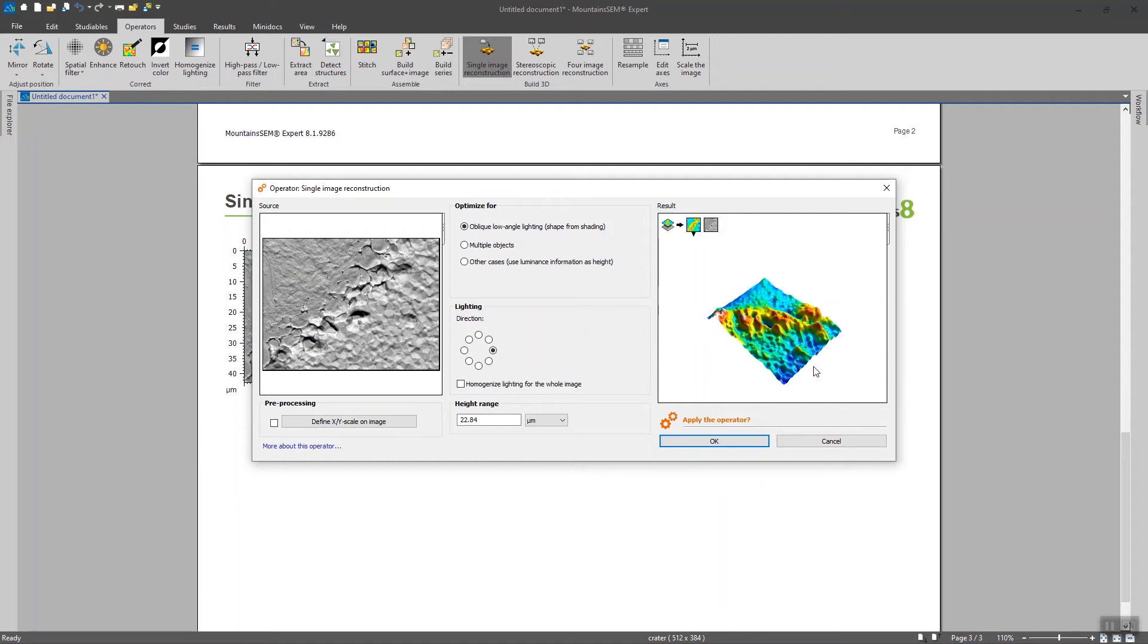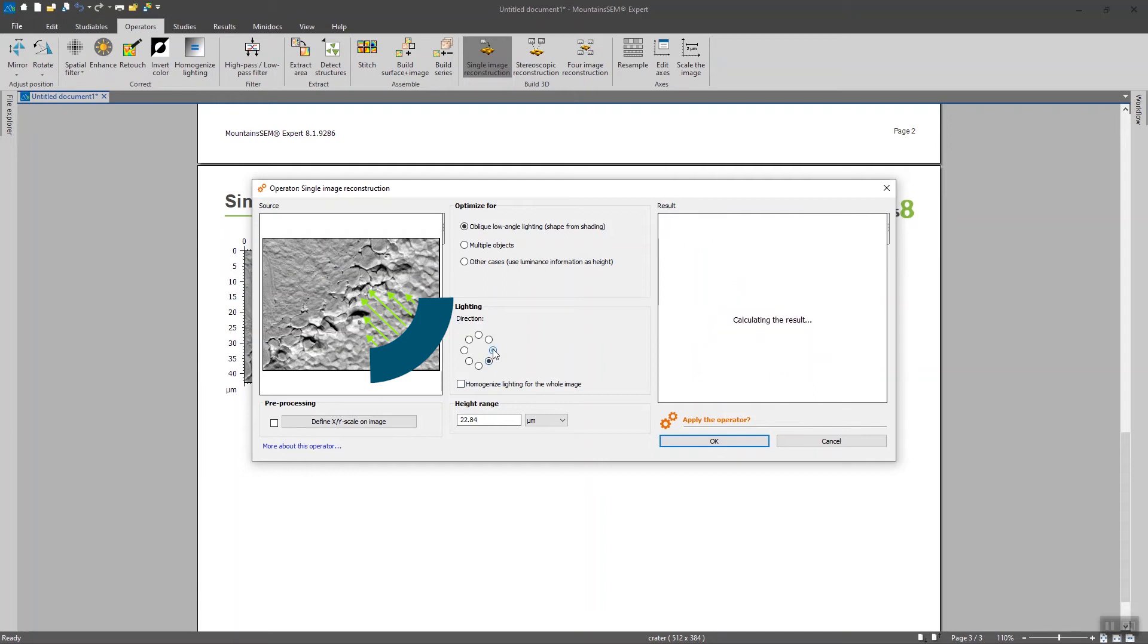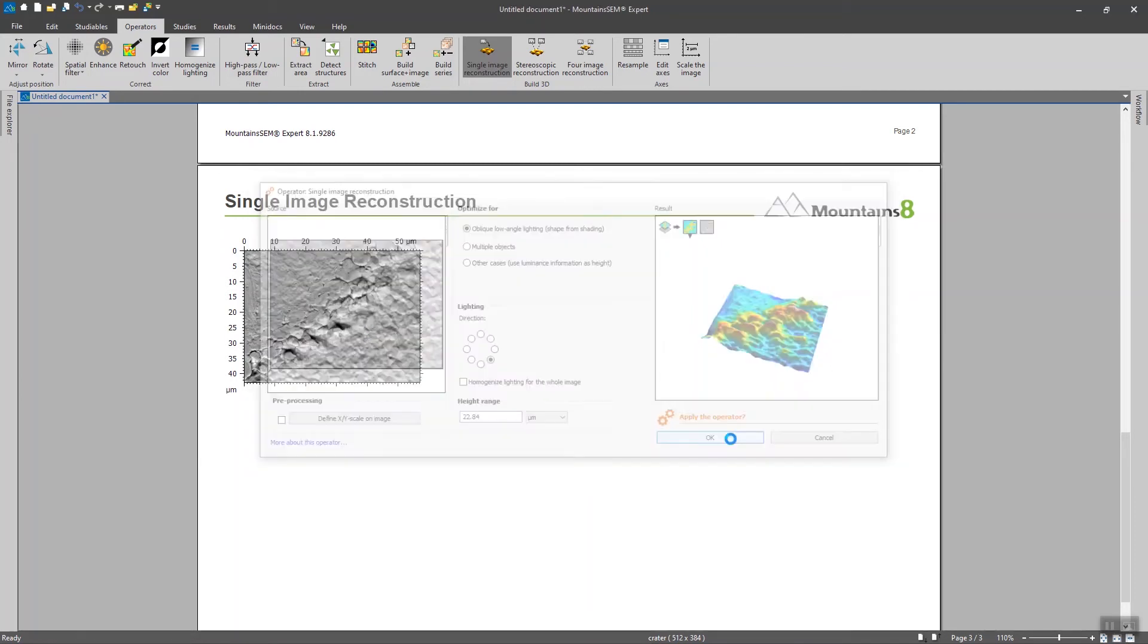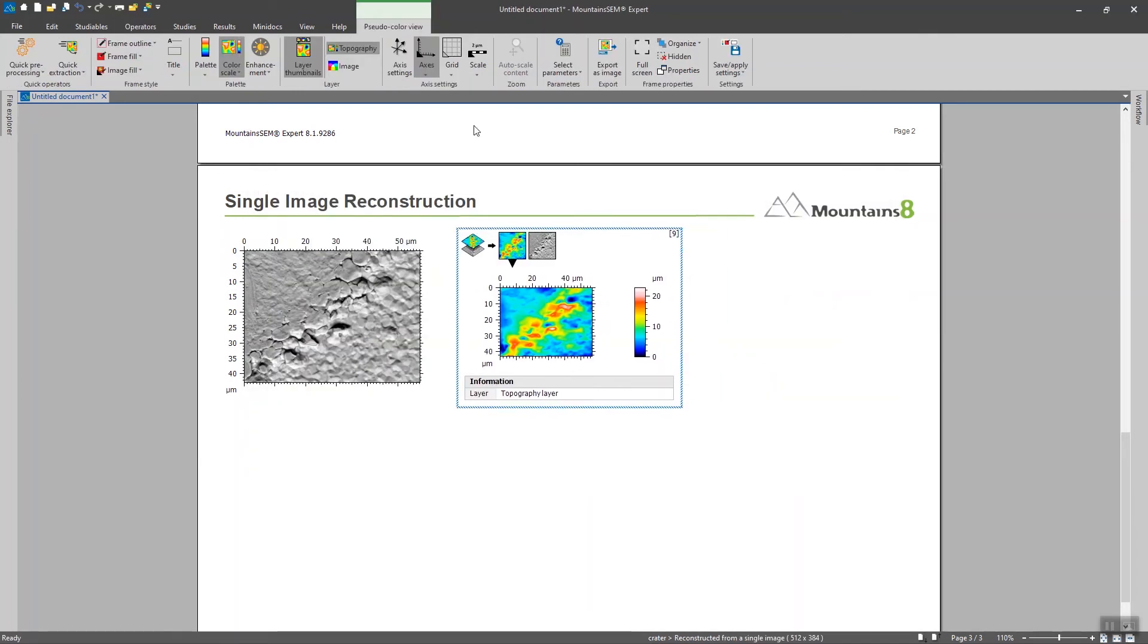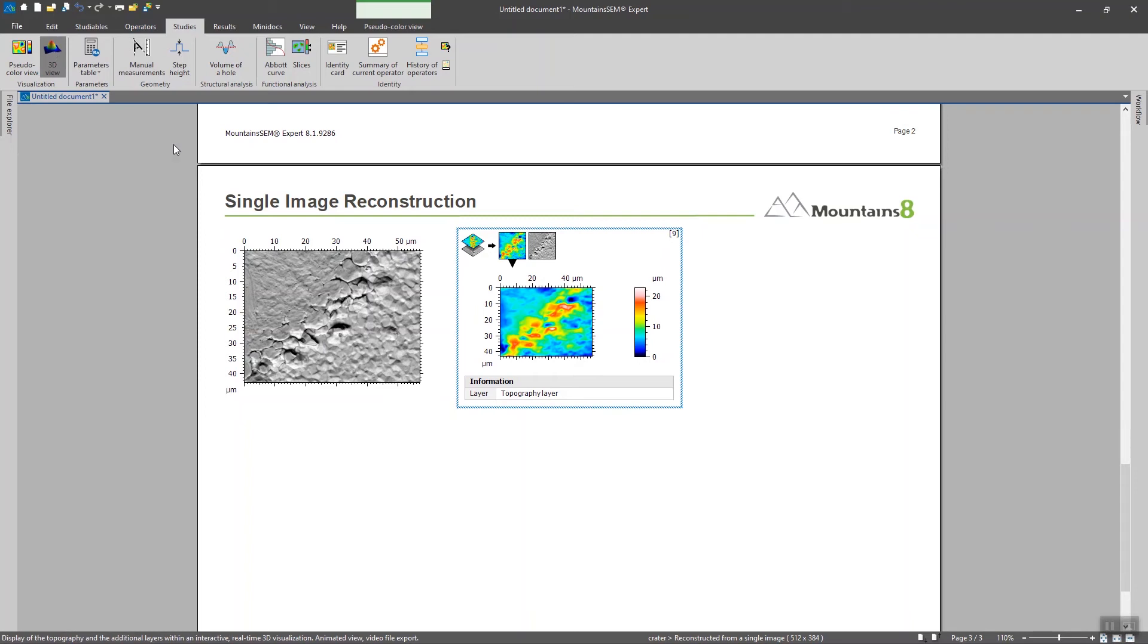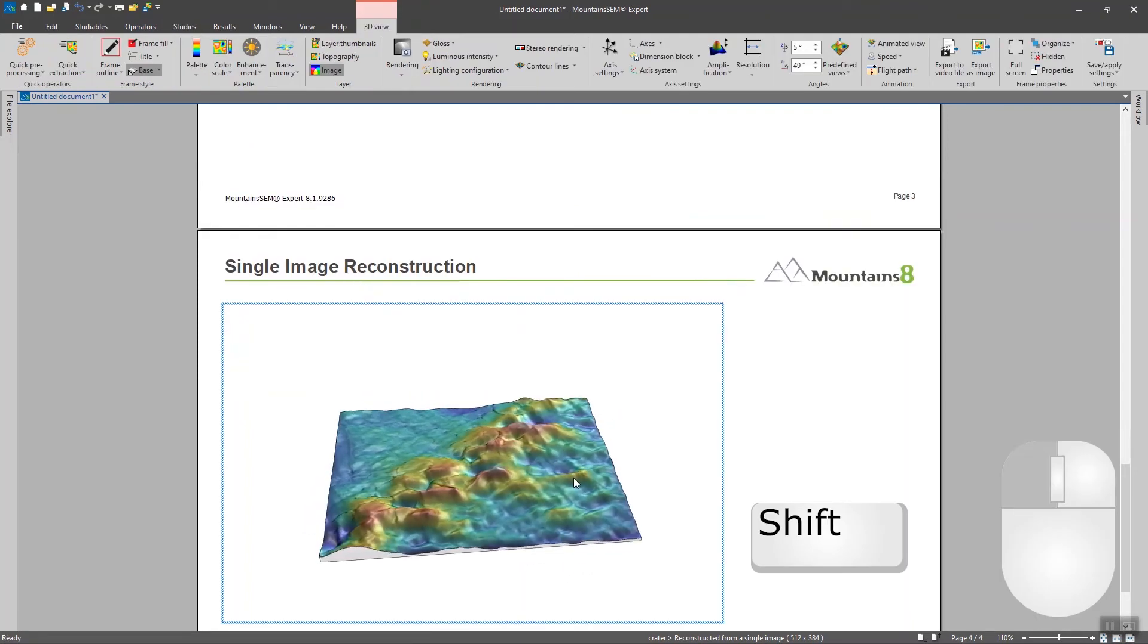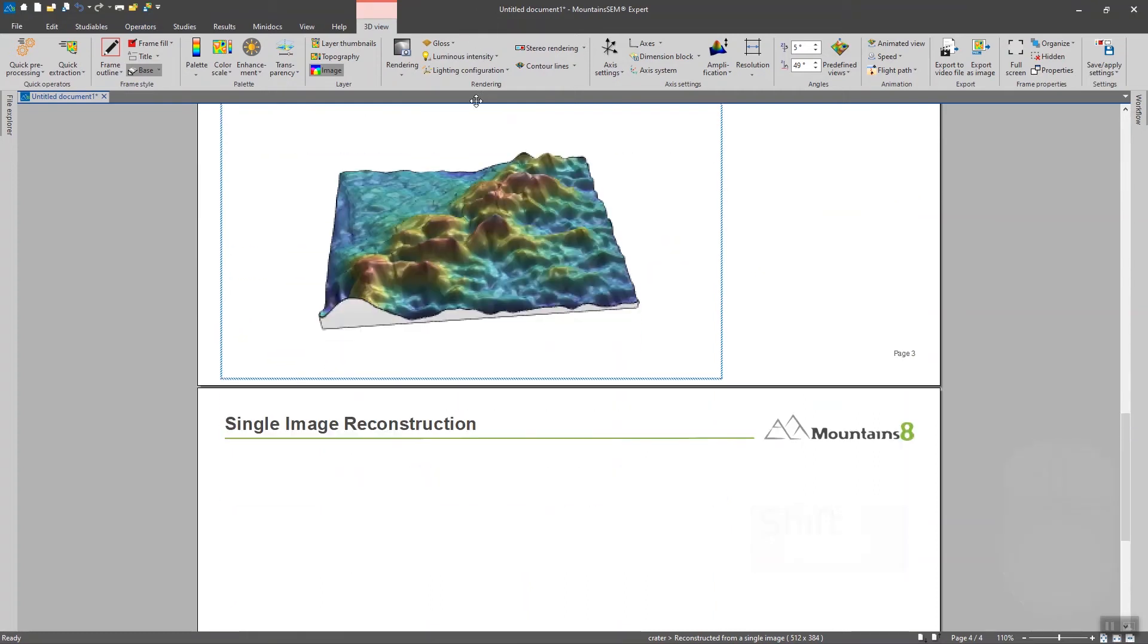So in this case we've got the impression of the light coming from this direction. So I'm going to take either this box or this one. I would take this one. And I'm going to click on OK and again to check out the results. And again I'm going to exaggerate a bit the z-height but I'm pretty happy with the results that I'm getting.